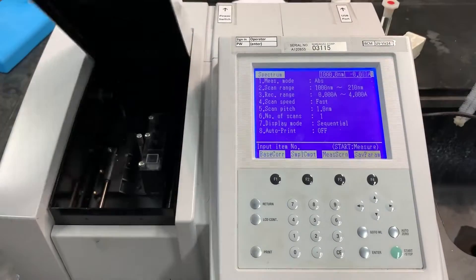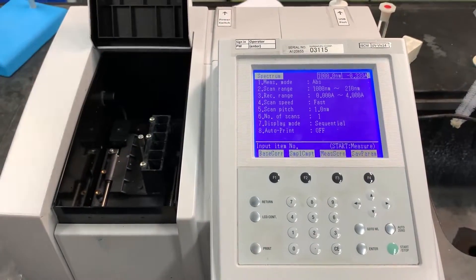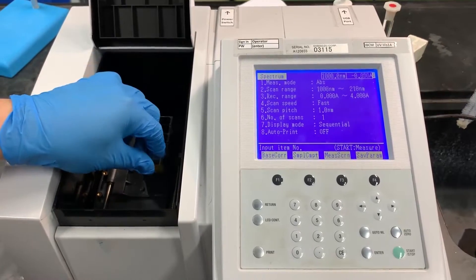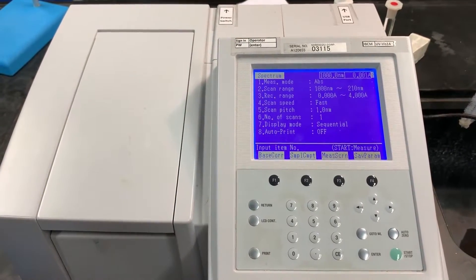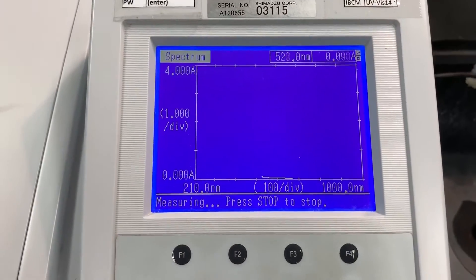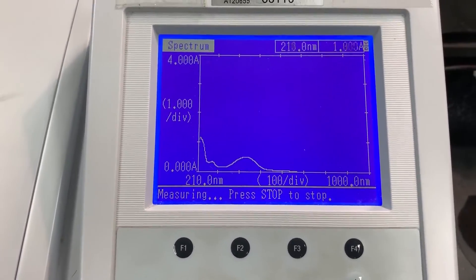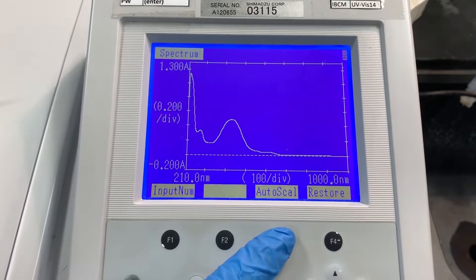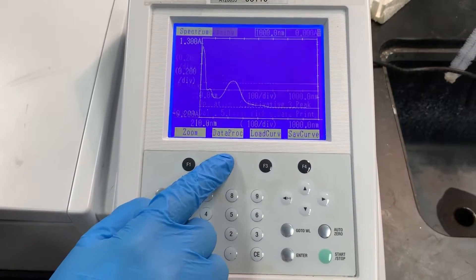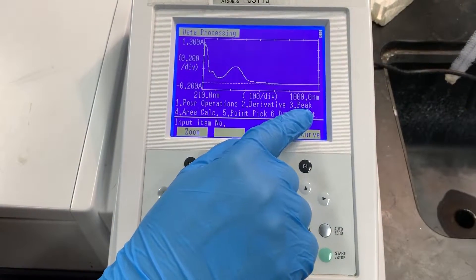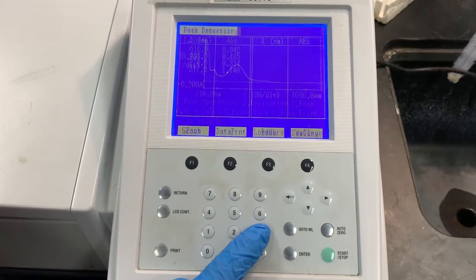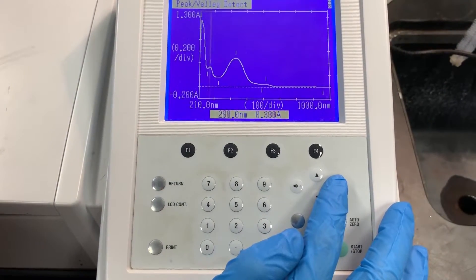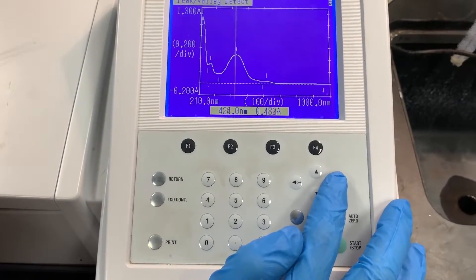Now that the machine is calibrated, remove the blank cuvette and replace it with the cuvette containing the solution for analysis. Press start and wait for the machine to complete the analysis process. When the analysis is completed, select zoom, autoscale, data processing, and peak to read off the values of maximum absorption. Alternatively, you may use the arrow buttons to manually read the absorption values on the graph.